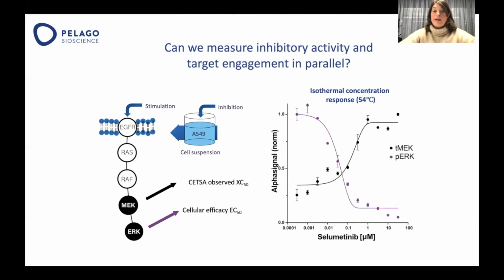Secondly, we looked at the level of phosphorylated ERK, where we could see that the amount of phosphorylated ERK decreased with increased compound concentration. Then, as a control experiment, we also looked at the total level of ERK, which was not affected by the increased compound concentration.